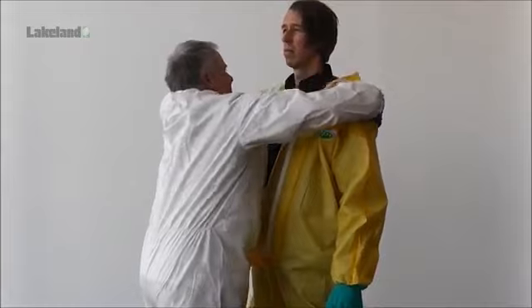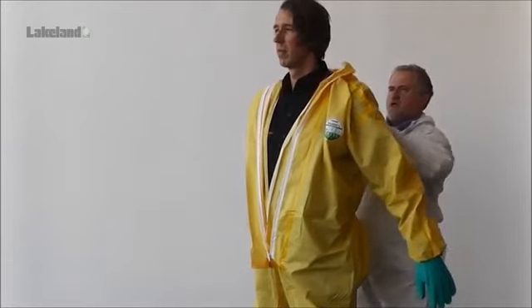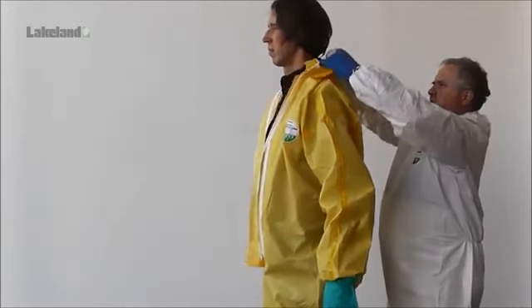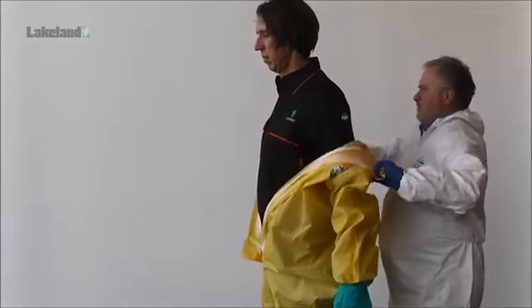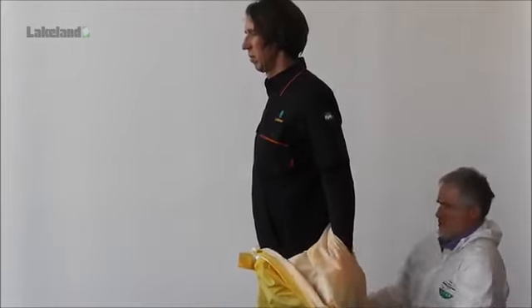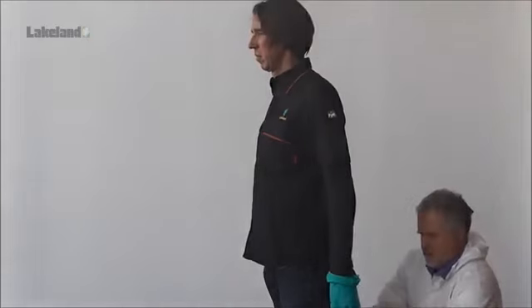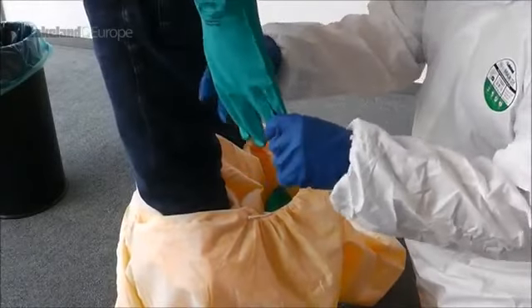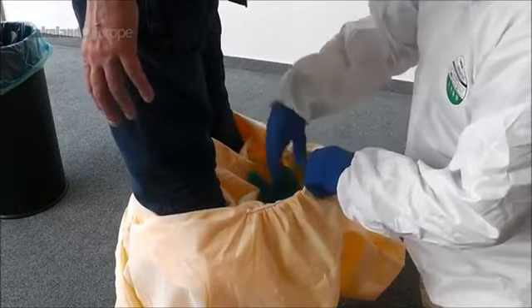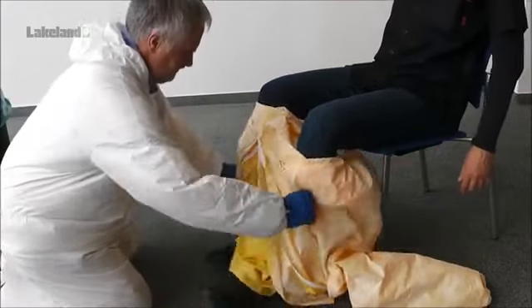The garment should be removed from the hood down as far as possible in one fluid movement, turning the garment inside out in the process and placing the gloves inside the used garment. The assistant, whose gloves may now be contaminated from touching the outside of the coverall, should take great care not to touch the wearer or his clothing during this process, especially when unfastening the zip and removing the hood. The final stage of removing the boots and legs of the coverall should be done with the wearer in a seated position.